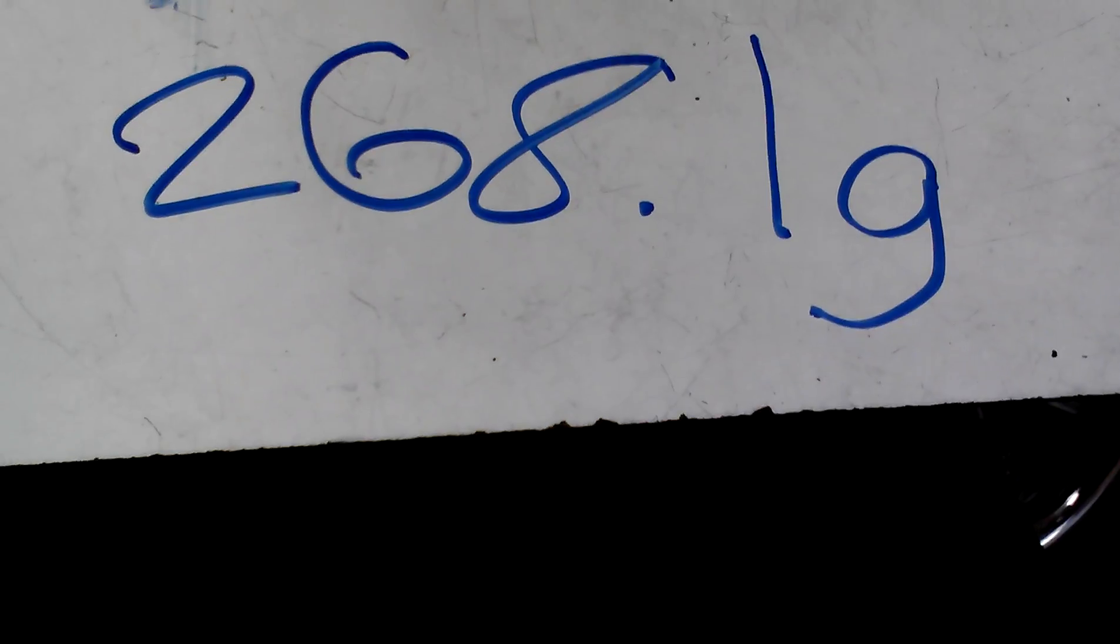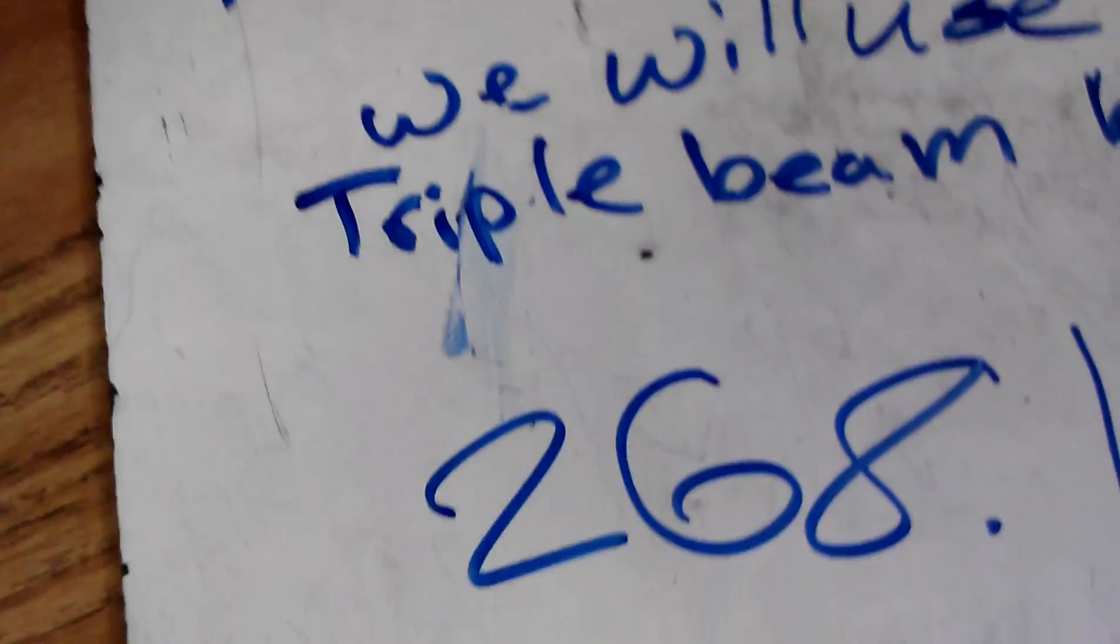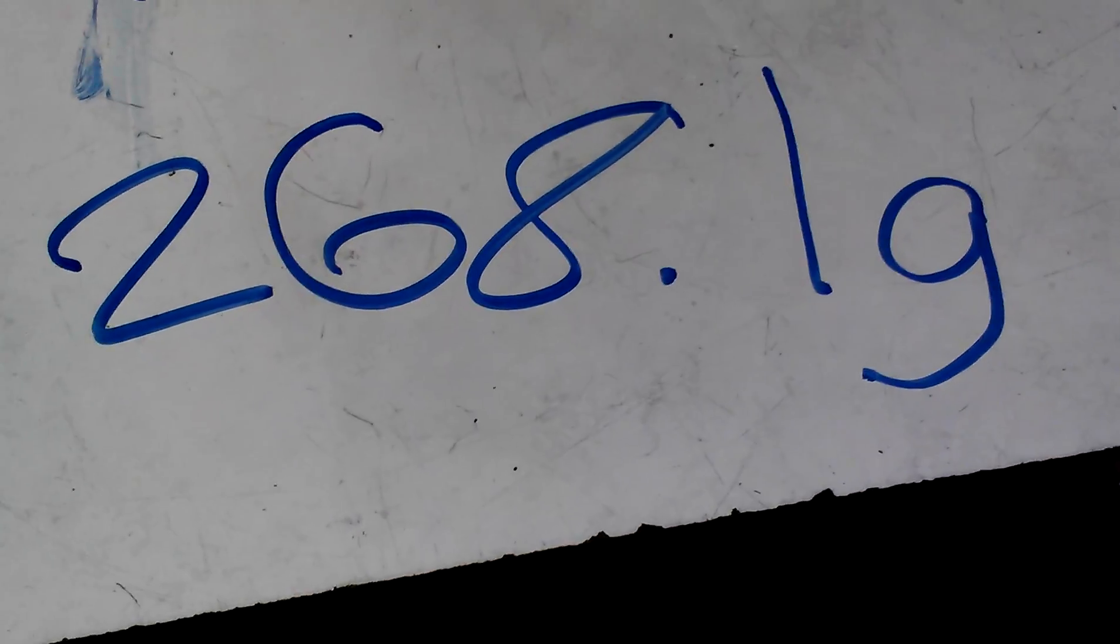So, it would be point instead of just... And you always want to try to label it, so you know what it is. And that is how you measure an object's mass using a triple beam balance. Thank you.